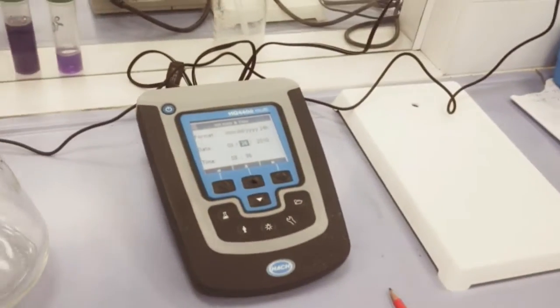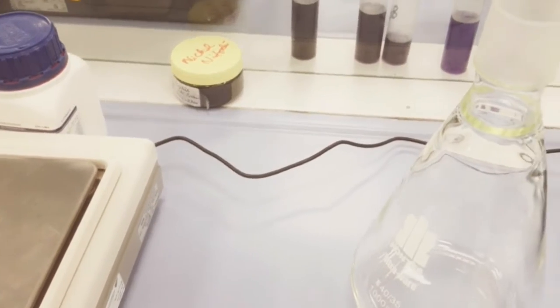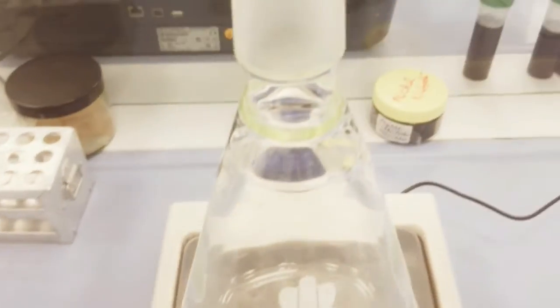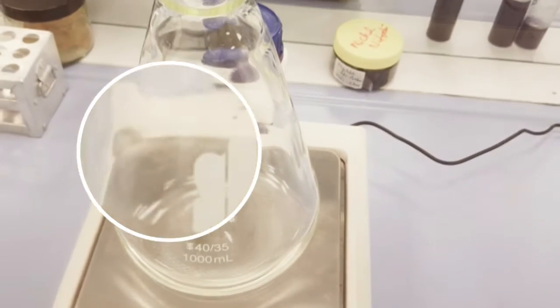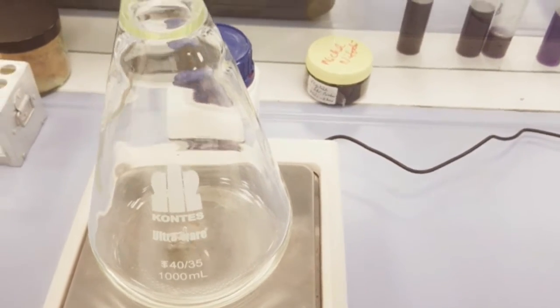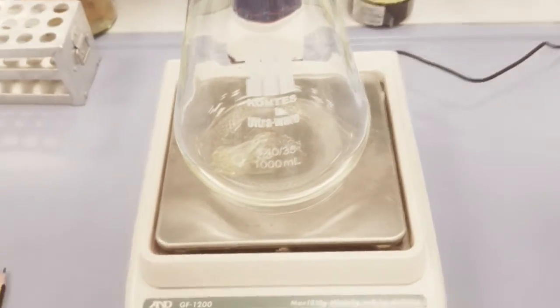Hello friends, in today's video we are going to do the batch adsorption of oil. Before going ahead, first of all we will prepare the oil emulsion. For preparing the oil emulsion, we are going to add 1 gram of the oil in 1 liter. Here I am adding it by a dropper. You can use a micropipette. Now this is around 1 gram.